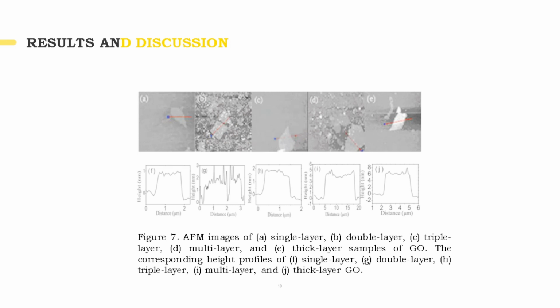The interlayer spacing is calculated to be 0.5 nanometer. Obviously, this value is much larger than that of graphite, which is normally 0.335 nanometer. Therefore, the interlayer spacing of graphene oxide that has undergone less oxidation than triple layer GO will be 0.335 to 0.5 nanometer.